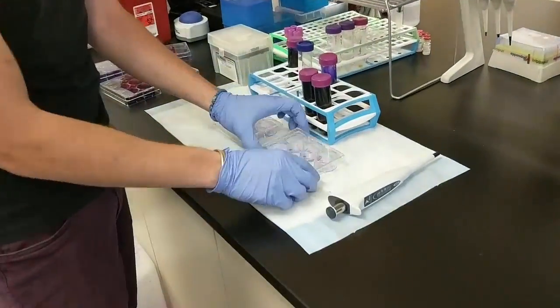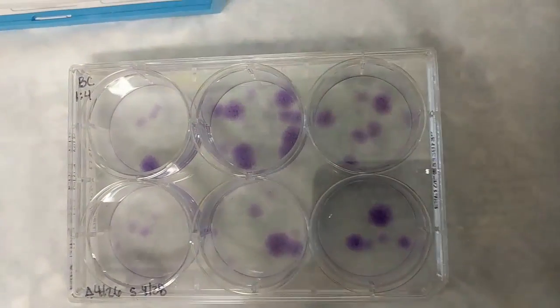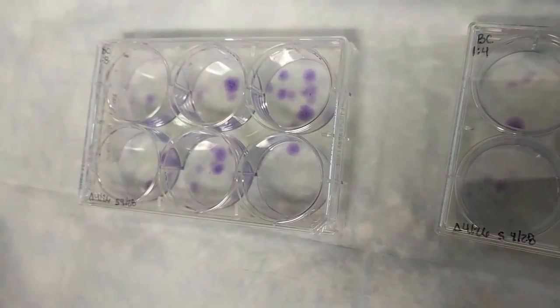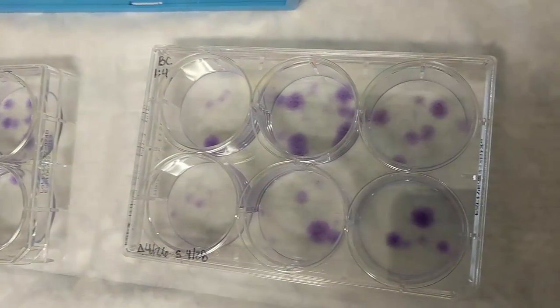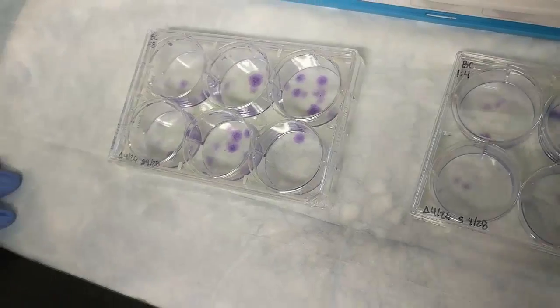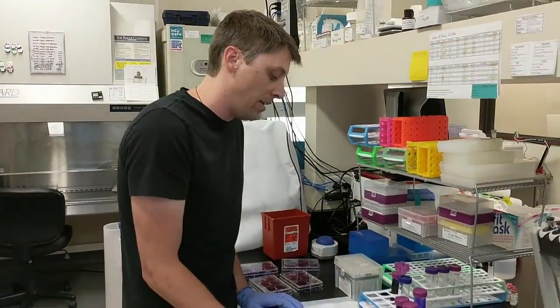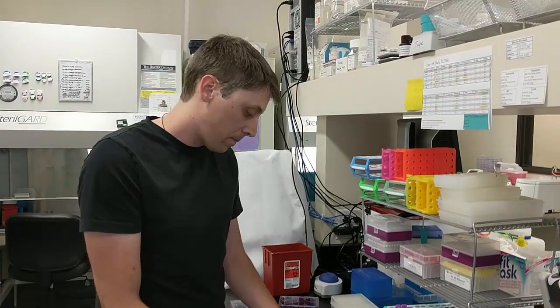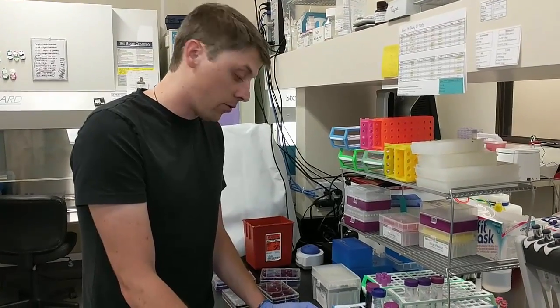So after staining these wells, what you can see here is we have the purple dots I was describing earlier. What these are are colonies of MSCs that we have isolated and grown out of buffy coat samples. We can now count the number of these dots and get an idea of how many stem cells were in our starting sample. Each one of those dots represents a colony, or a colony forming unit. Yes, that's correct.